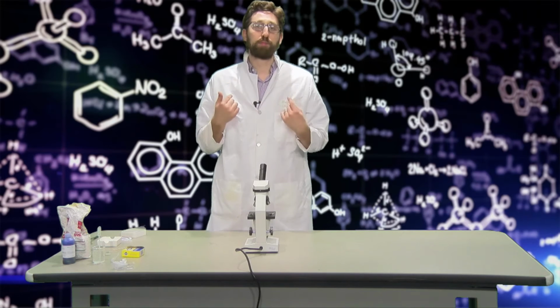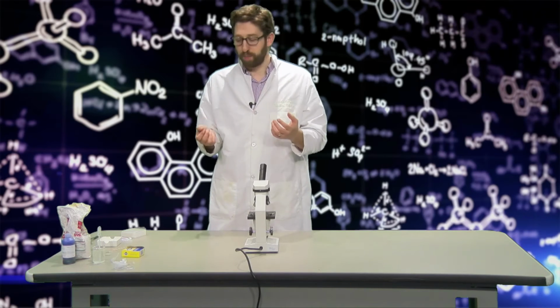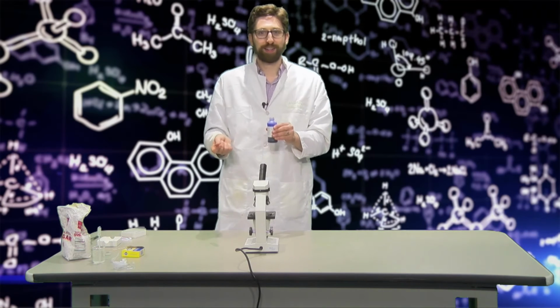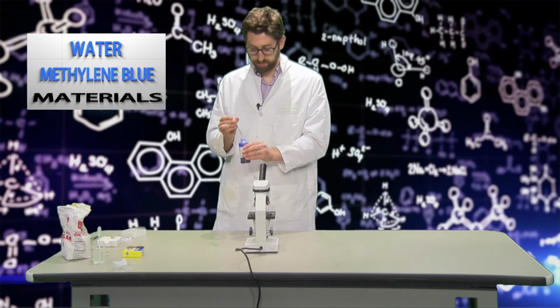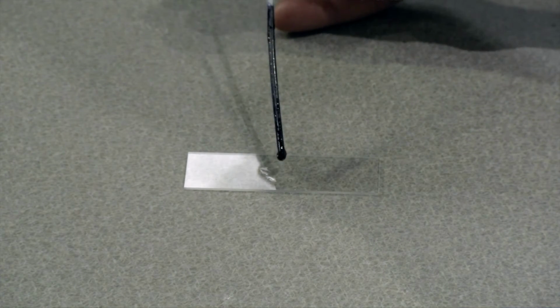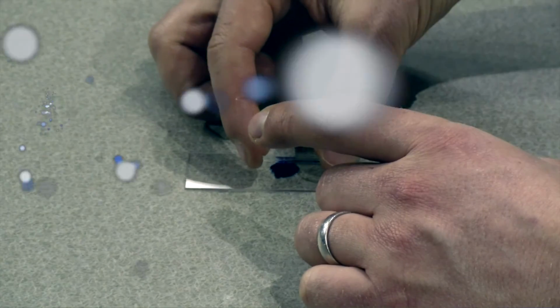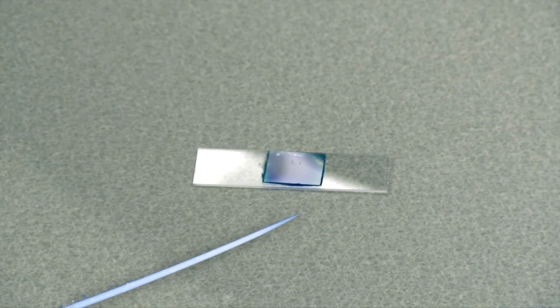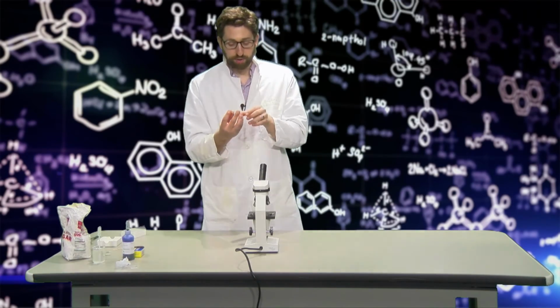Now, the things that are in my mouth are actually really hard to see, and I won't be able to see it with just water. So I'm actually going to use another liquid in my wet mount slide, this blue dye. Putting my blue dye right in the middle of my slide, and I only need one drop. It's very strong dye. So I'm going to take one more cover slip, pick this up, and tilt. And there we go. I now have a sample of what's inside my mouth ready to look at under the microscope.